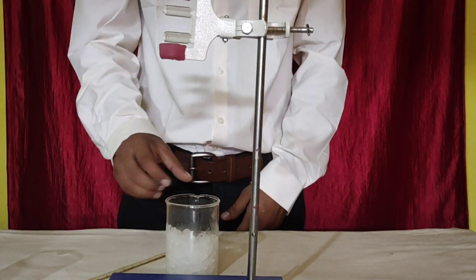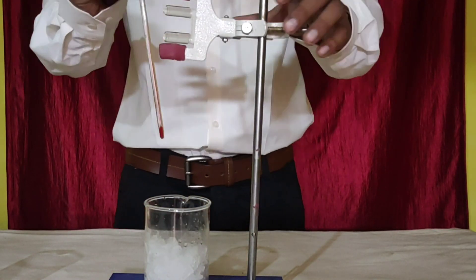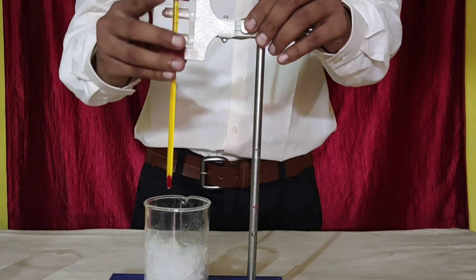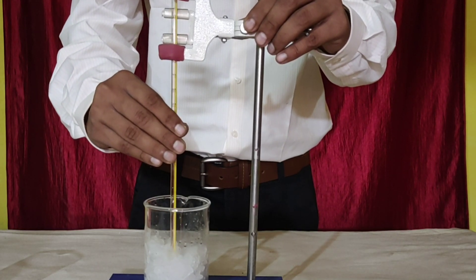How will you proceed? Take crushed ice in the beaker, and hang the thermometer from the clamp of the stand in such a way that the bulb of the thermometer is completely inside the ice.